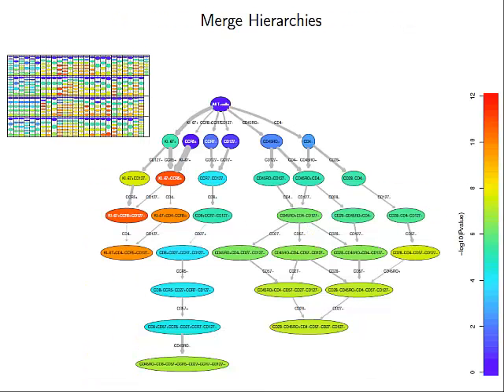Still not helping, until we get to this part. We took all those 101 paths and merged them together. This figure is the real money shot because it combines everything in the data. This is sort of like the bird's-eye view of the data. It says, I've looked at everything in your data, all the significant immunophenotypes that distinguish between group 1 and group 2. Here's all the important ones. I've combined them together.